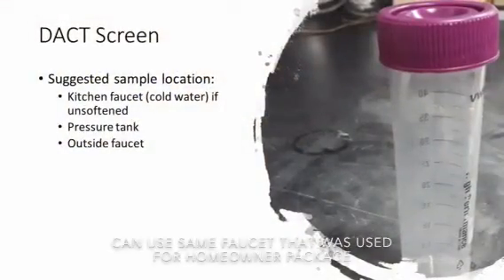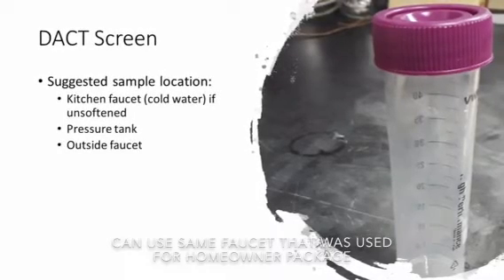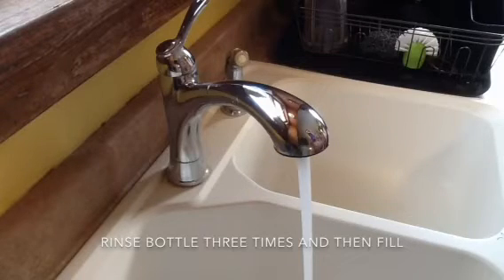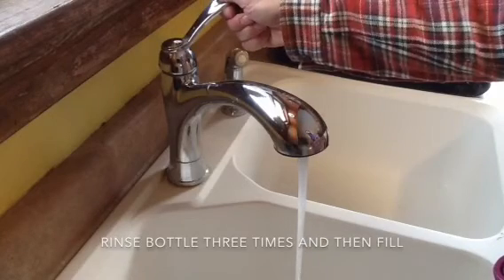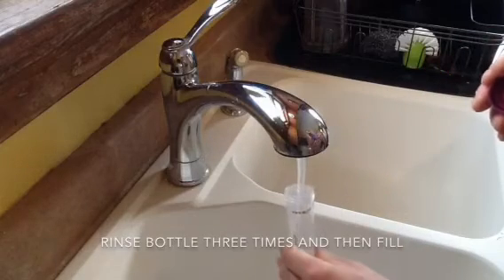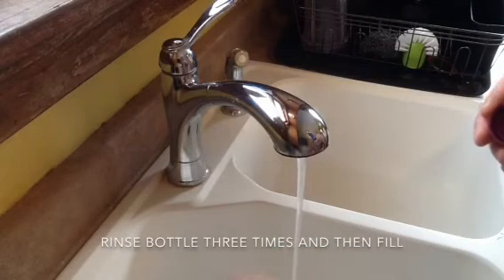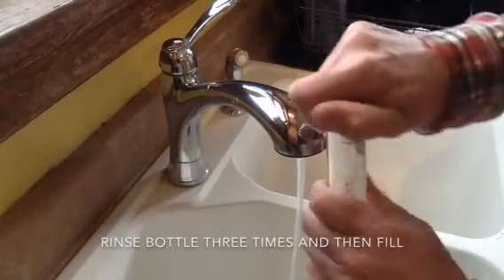If you chose to perform all 3 tests, the last test is the DACT screen. You can collect this from the same faucet you used for the homeowner package. For this test, ensure that the water has been running for at least 5 minutes prior to collecting the sample. Again, slow the water down till it's about a pencil width thick. And for this sample, you're going to want to rinse the sample vial 3 times before filling with the actual sample. Fill to within a 1/4 inch of the top and replace the cap.